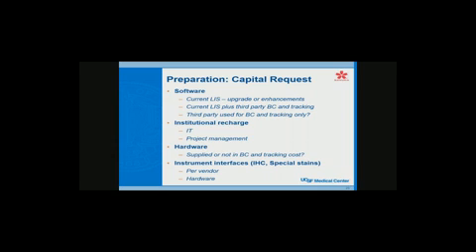In other words, they set up all the meetings, they handle all the timelines and everything, and that can be helpful because that's what they do for a living, so they know how to push things. Hardware, one of the things you have to think about is if you're doing your own system, in other words, you're upgrading your own LIS, or you're doing a third party that doesn't sell any software or hardware, then you have to do all your own hardware.